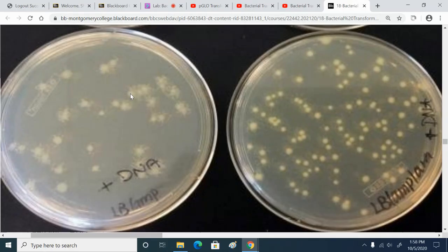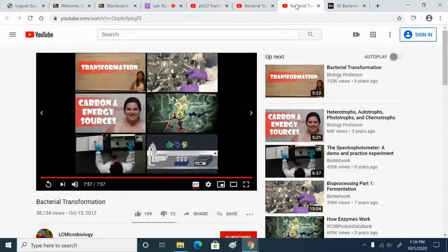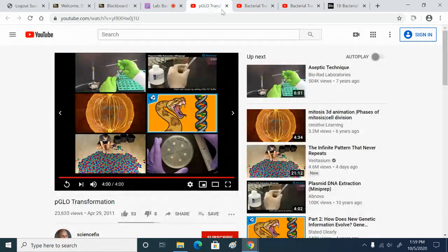So does everybody understand? Yes. Well, let's watch some videos of the process. The first video will go through the process of transformation, and then we'll see some actual experimental procedures that are done the way that we would have done it, or similar to how we would have done it.